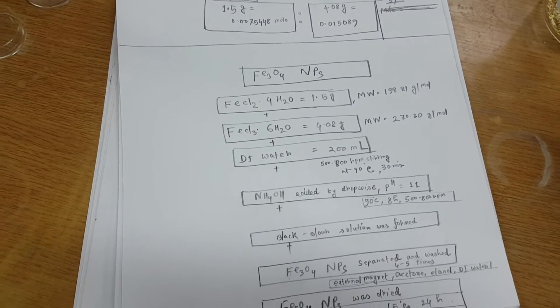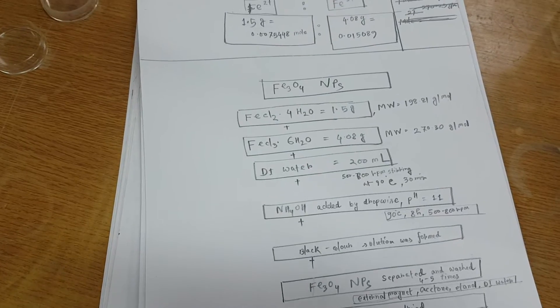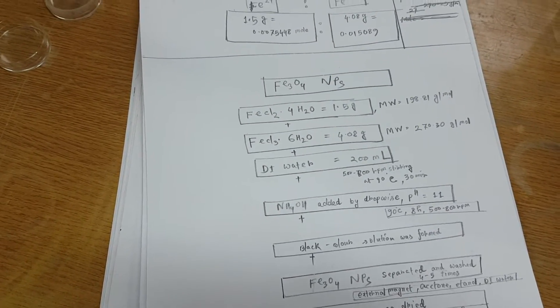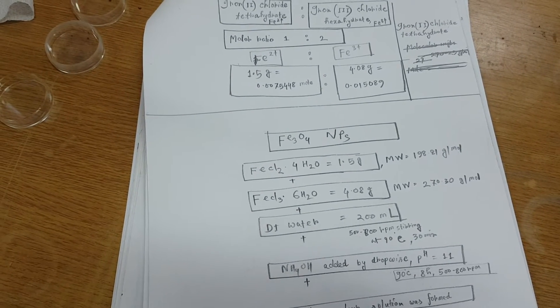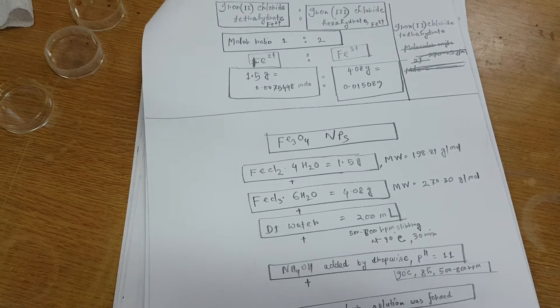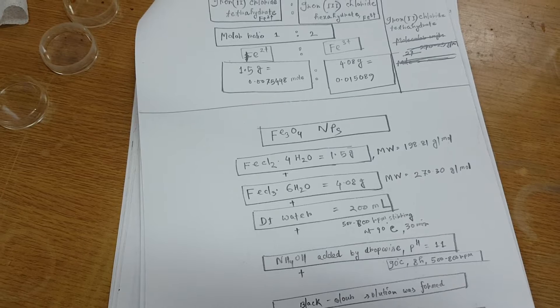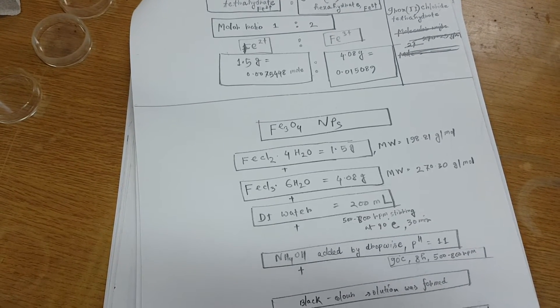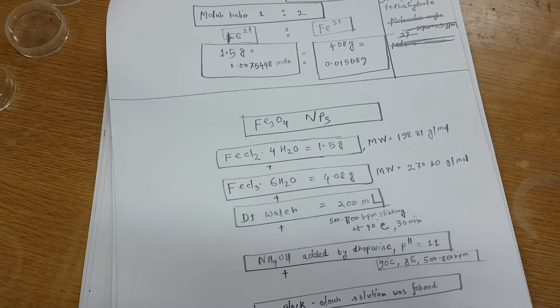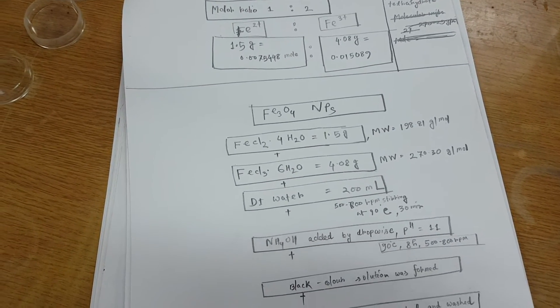So basically, iron 2 plus and iron 3 plus has the molar ratio 1 to 2. So if I take 1.5 gram of FeCl2, then FeCl3 comes out 4.08 gram because of the high molecular weight 270.30 gram per mole.